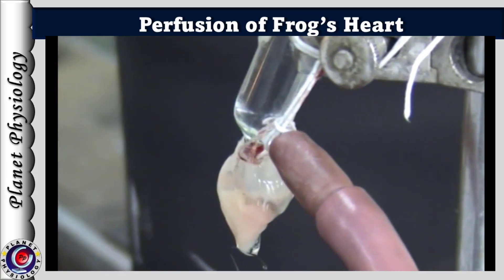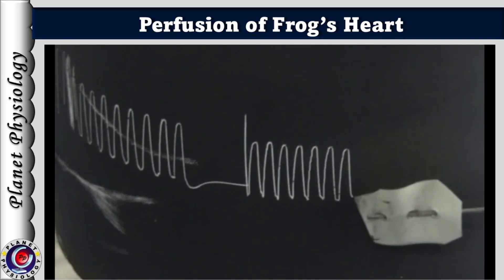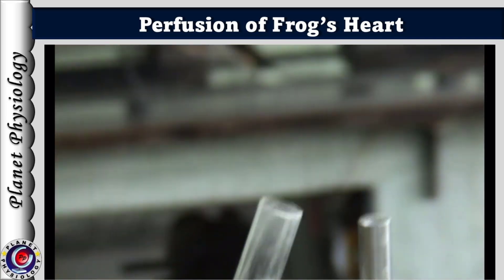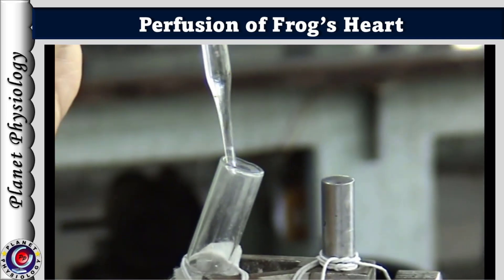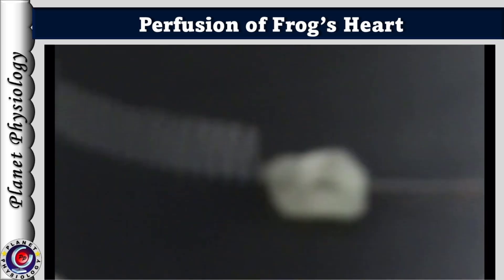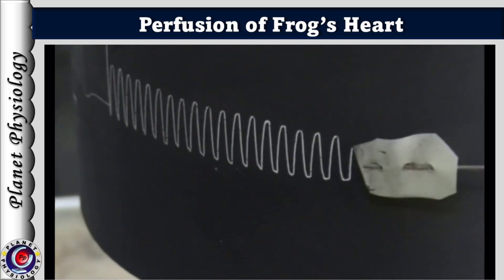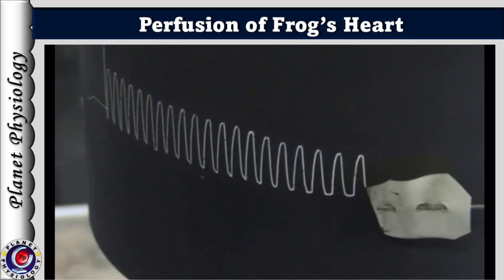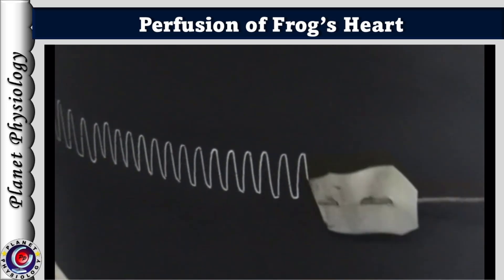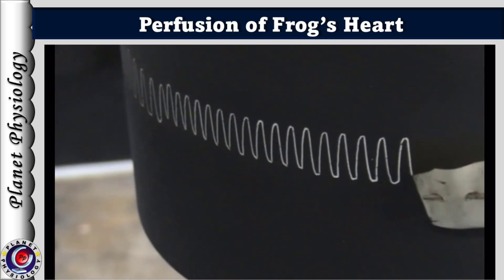The normal cardiogram is recorded on a slow-moving kymograph. Note that in this experiment, upstroke represents systole and downstroke represents diastole. After recording the cardiogram for sufficient duration, one or two drops of 1% potassium chloride are added to the perfusing fluid. The heart rate and force of contraction decrease, and the heart slows down. On further increasing the concentration of potassium chloride in the perfusing fluid, the heart stops in diastole, represented by a straight line after the downstroke.